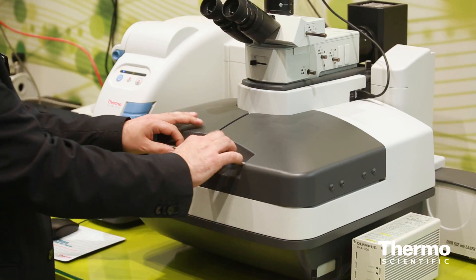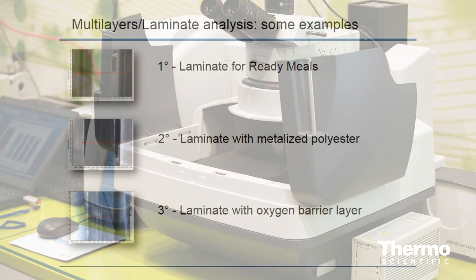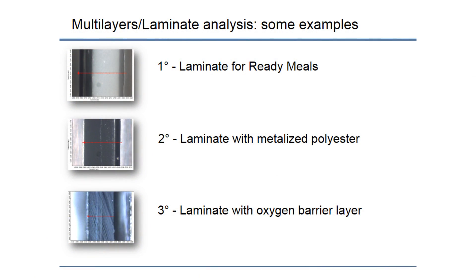You simply place the sample in the middle, close it, put it under the microscope, and you can run the data easily. You can then analyze the entire cross-section of the packaging.